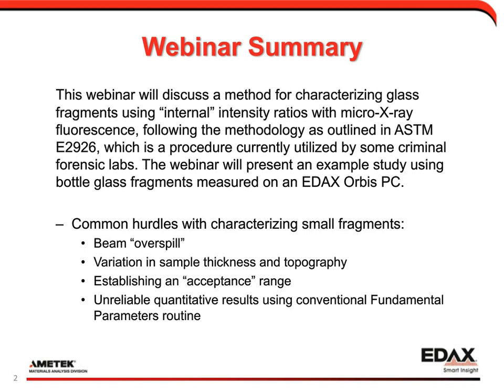So this is likely to be a relatively familiar topic for those who are in the field of criminal forensics, which today seems to be a relatively large portion of the people who are joining us. But for those who are not in criminal forensics, one can imagine that from perhaps a breaking and entering scene or a hit and run scene, for instance, broken glass can be recovered from the scene, which will be used as evidence. And they can come in an assortment of sizes and thicknesses and shapes, ranging from the micron level and anywhere greater.